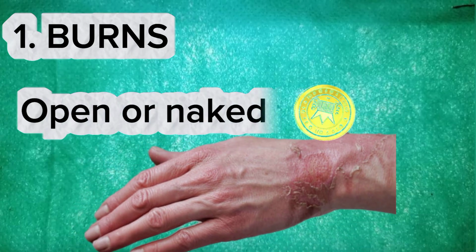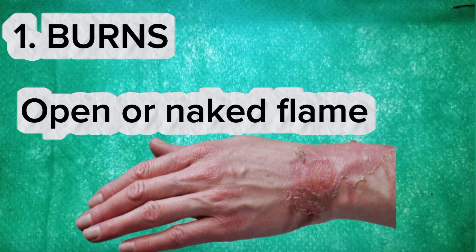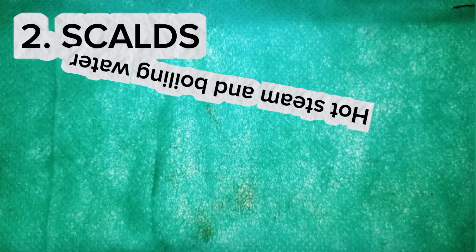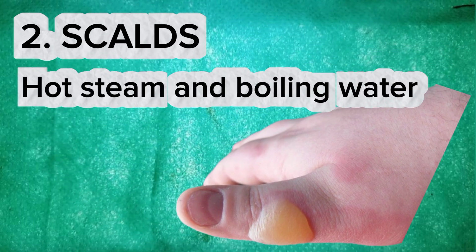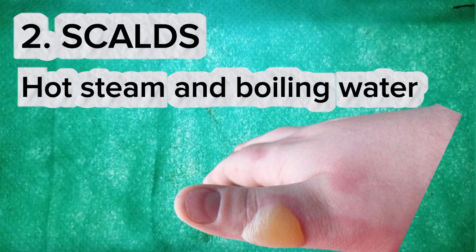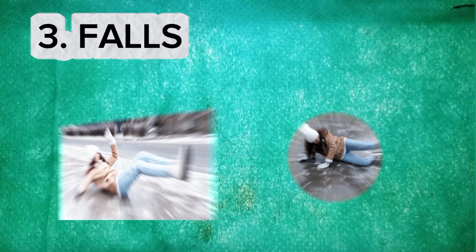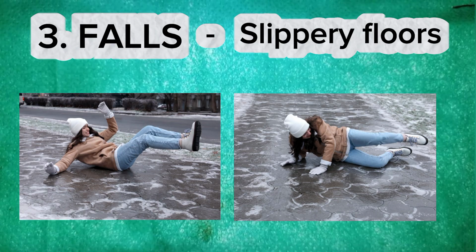We have burns. Burns are caused by open flames or hot objects like metals. Scalds are caused by steam or hot water. Falls are caused by slippery floors.